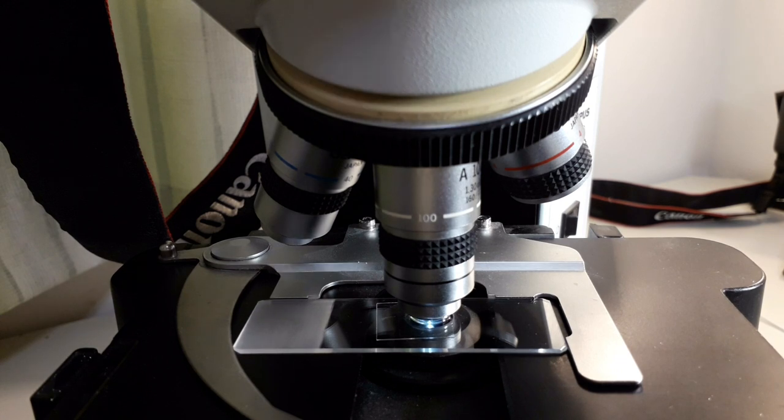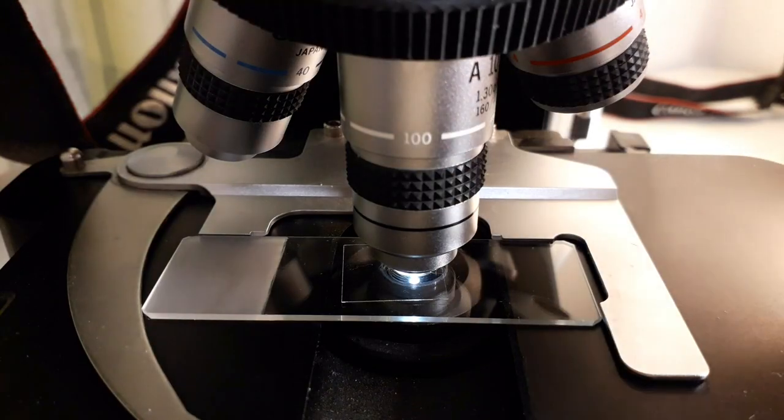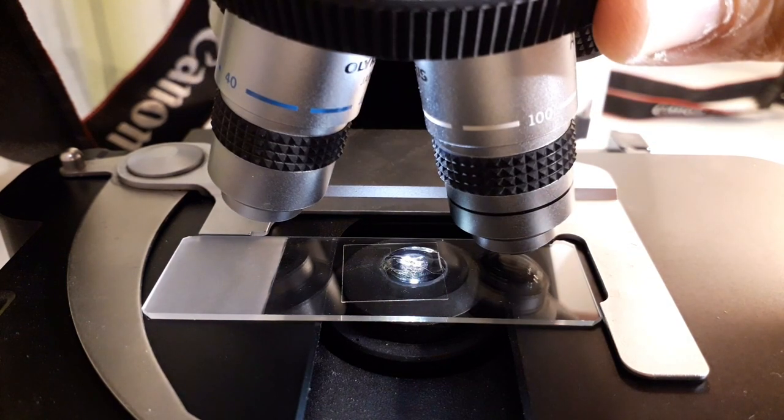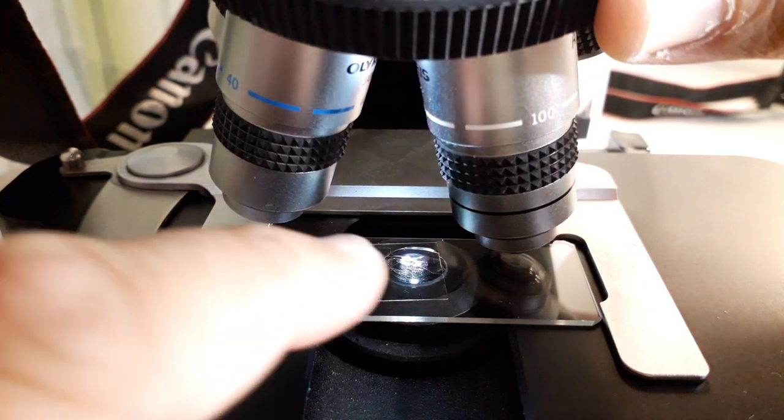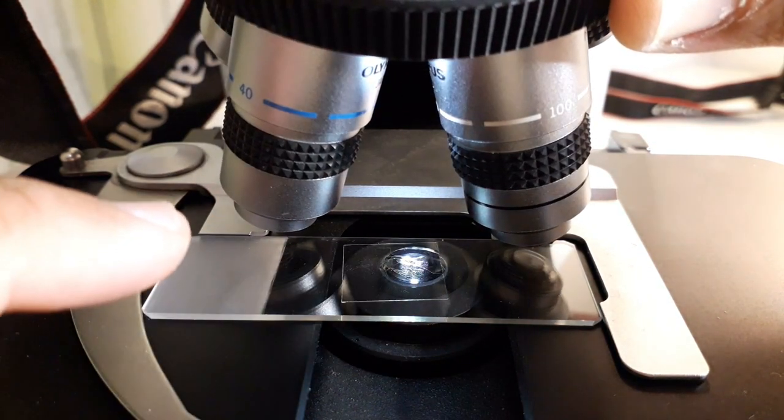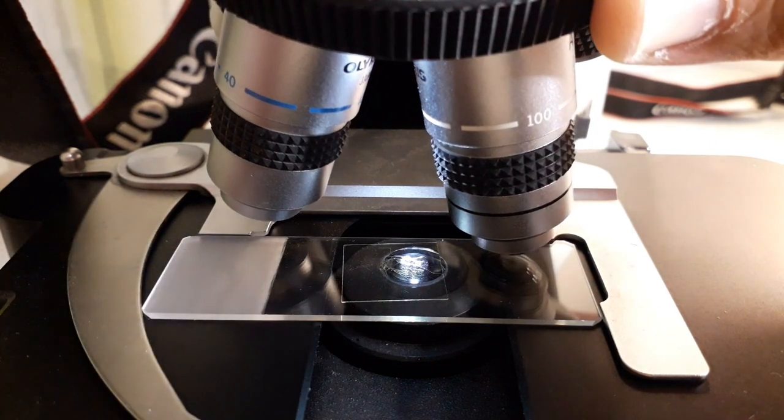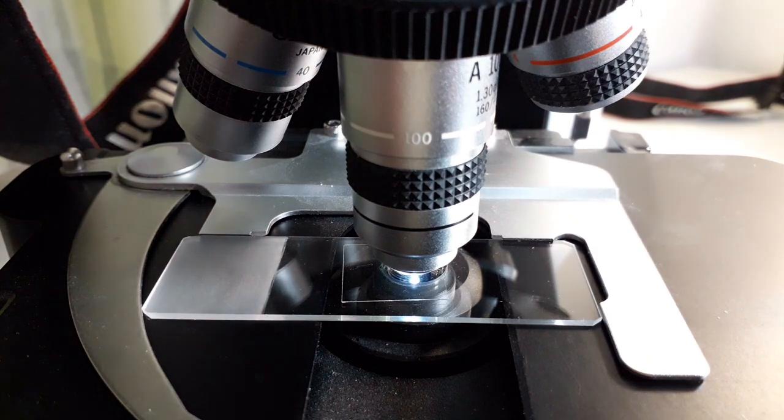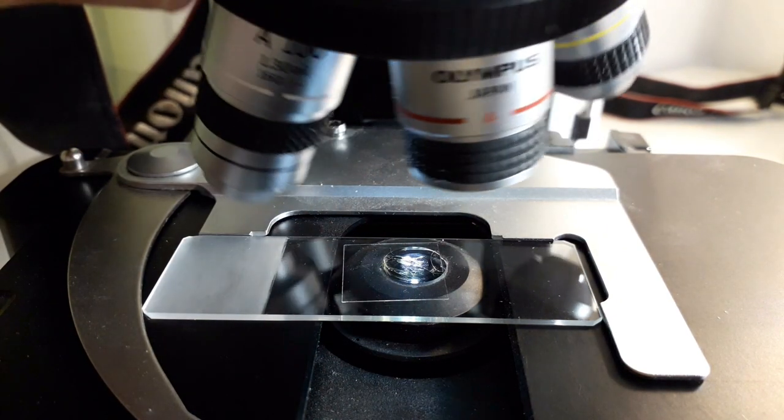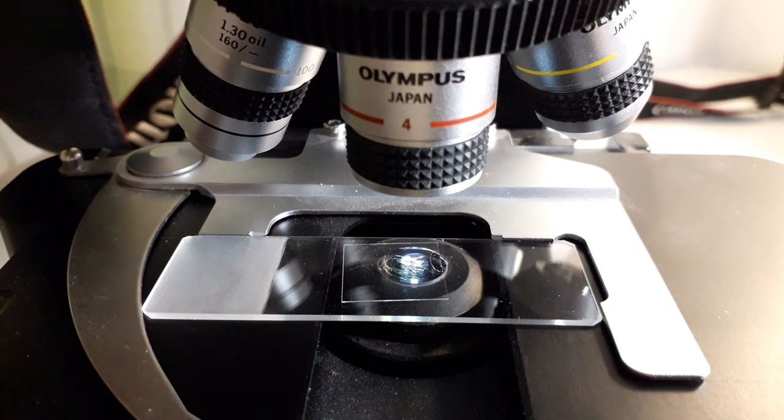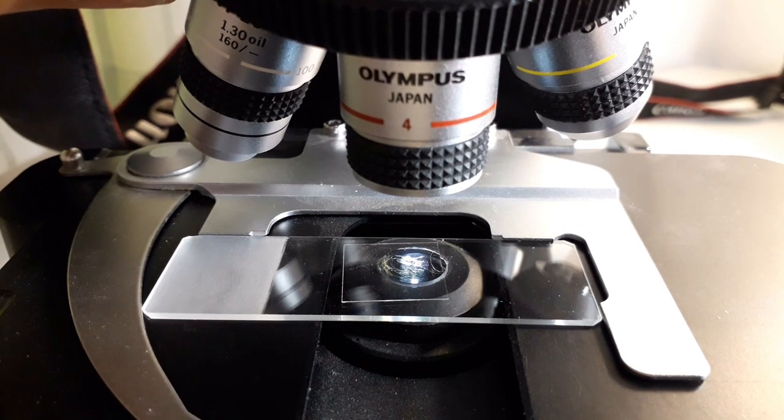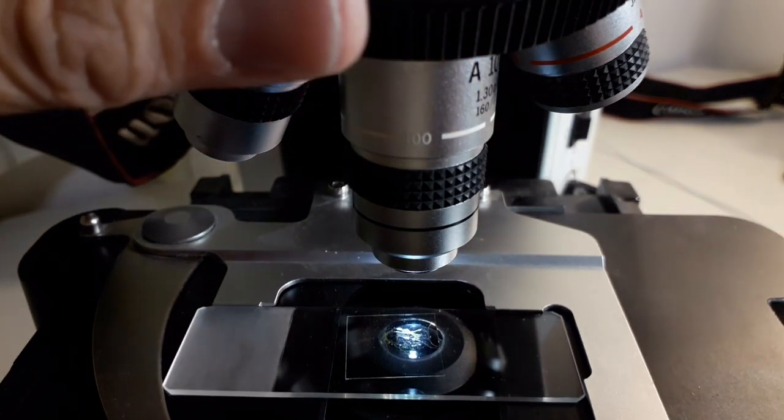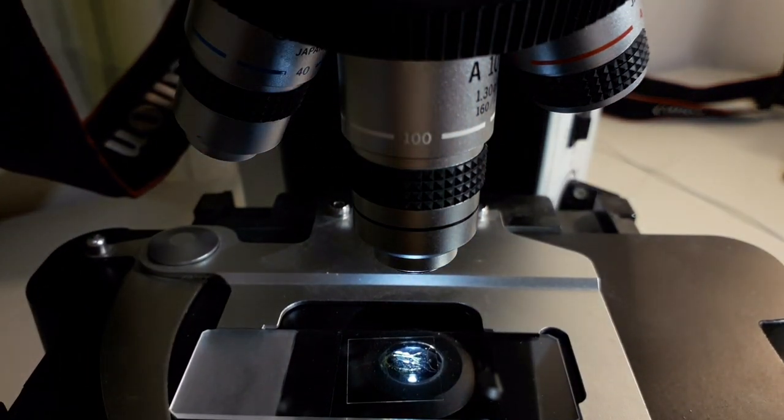Then I can do oil immersion microscopy this way. When I now want to use the 40 times objective, I cannot do this, I cannot switch back because then I'm going to contaminate the 40 times objective with oil. This is exactly one of the things that many beginning students have done and this actually destroyed the 40 times objective. The 4 times objective is okay because there is no way that it's able to contact the oil because the distance is so large, but for the other high power objectives this can be a problem.